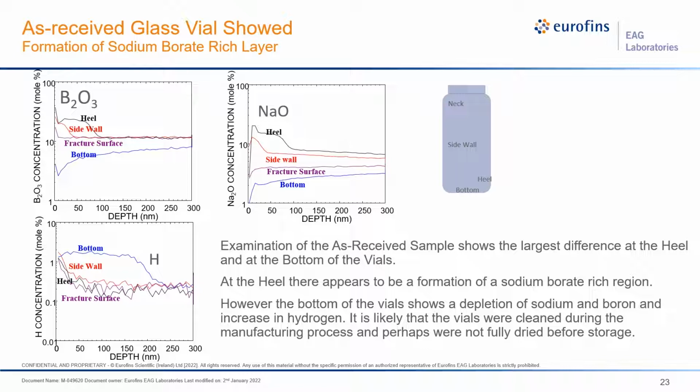So many efforts have been put in to understand the flaking off from this corner and how to prevent it. As you can see in the SIMS profile of a manufactured glass, we can see these distributions very clearly.